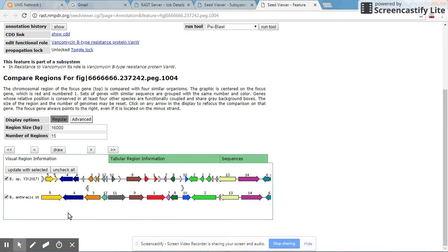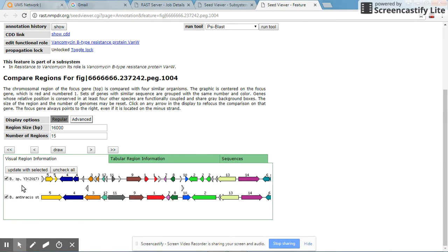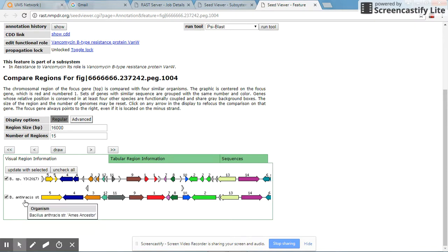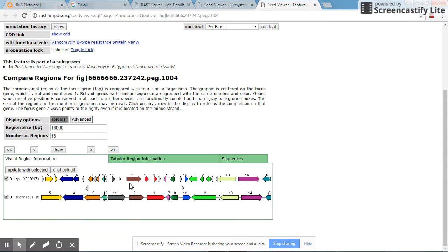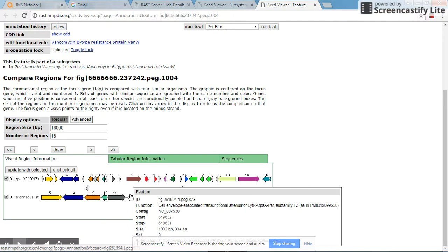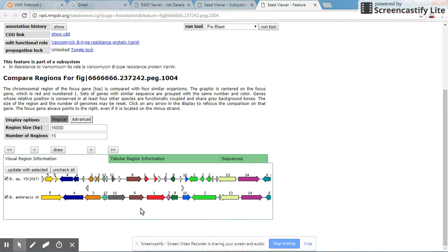It has compared this with Bacillus anthracis. You have a comparison, and it shows you the gene order as well as the location of the specific gene.